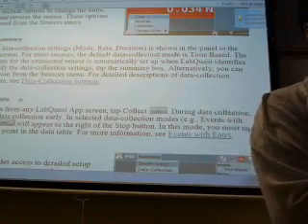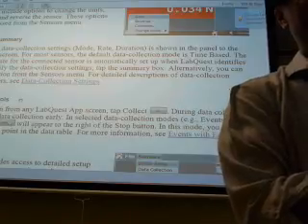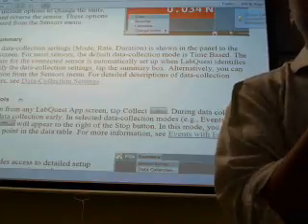It's going to take a while, isn't it? Yes. You know, let's stop this one because this is going to take too long. 2 minutes is going to take too long. Let's increase the sampling rate. This is just a test to make sure it's working.